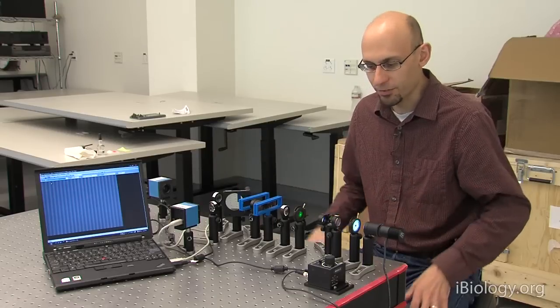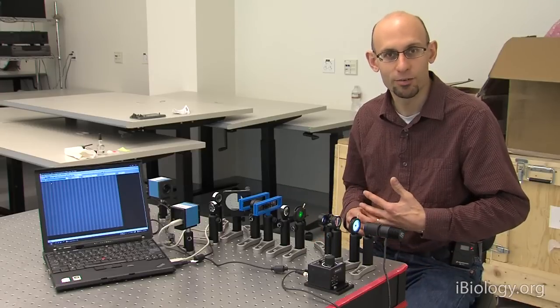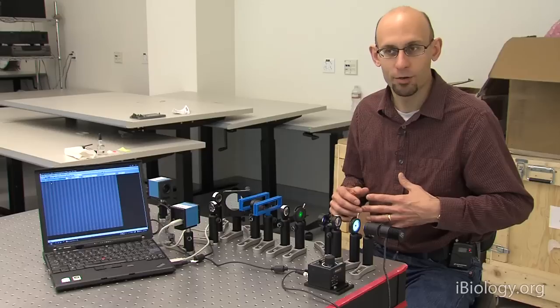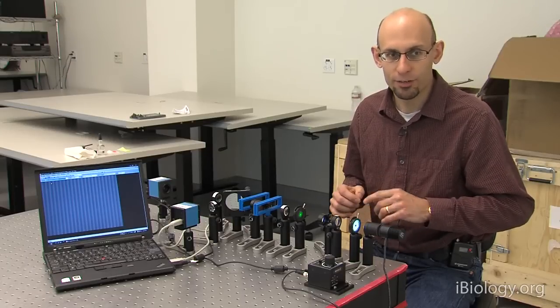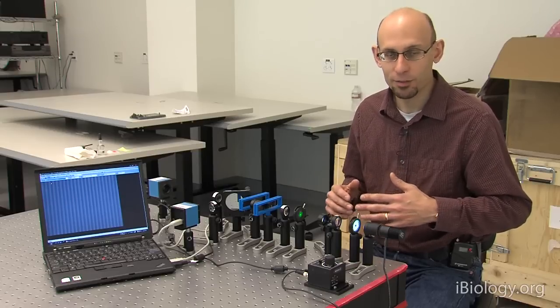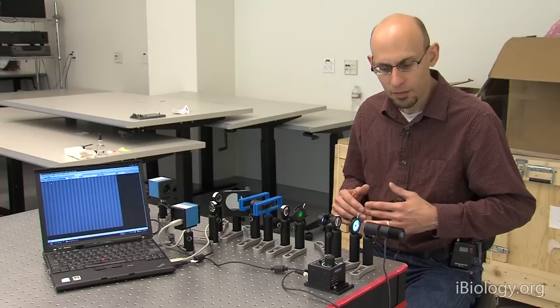So the optical system in front of me is actually a microscope, although it may not look very much like any microscope you've used before. This is a system built out of simple optical components so that we can get access to all the planes of the microscope for demonstrating these principles here. But in all respects, it is really analogous to the kinds of upright and inverted microscopes you've used.